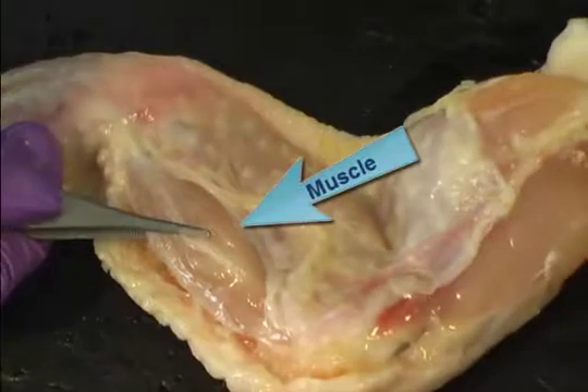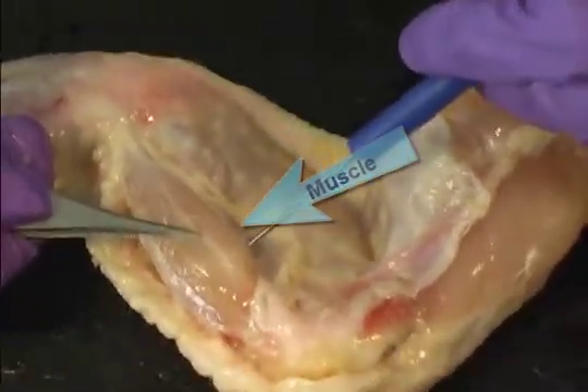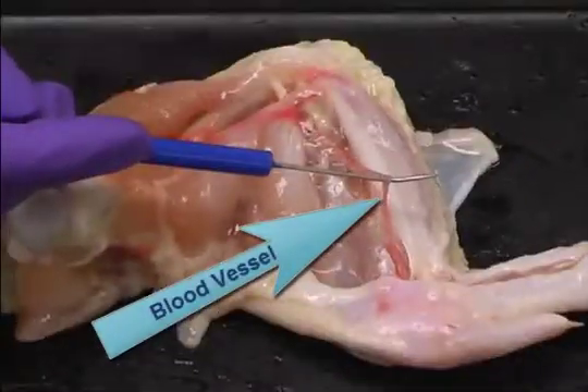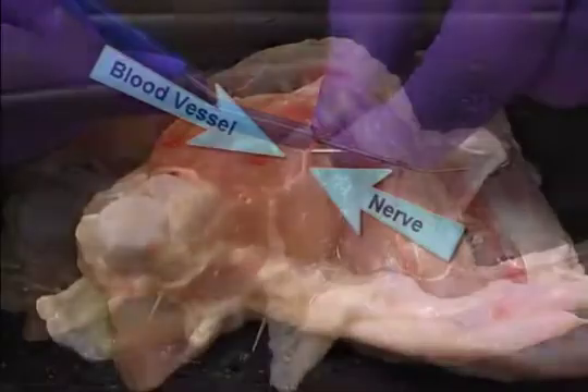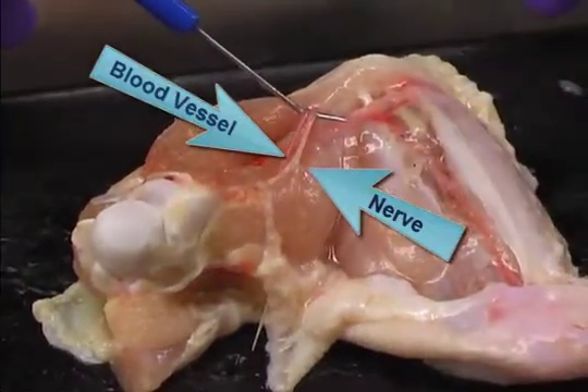Now look at a bundle of pink, pale muscle surrounding the bone. Gently observe the blood vessels that look like thin red lines running with the muscles. Nerves are also present as thin, white, string-like structures that run near the blood vessels.